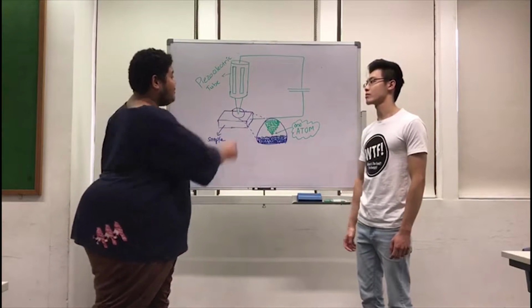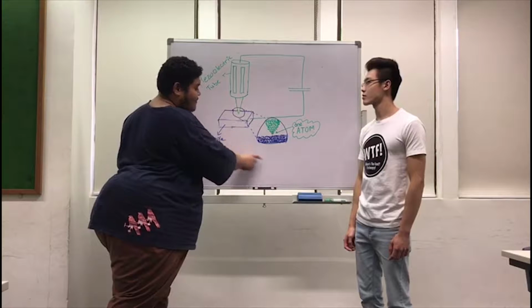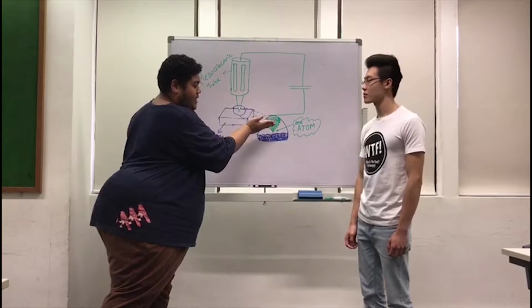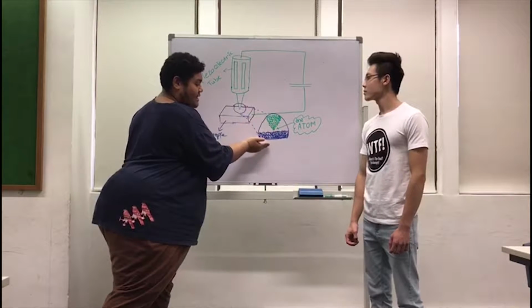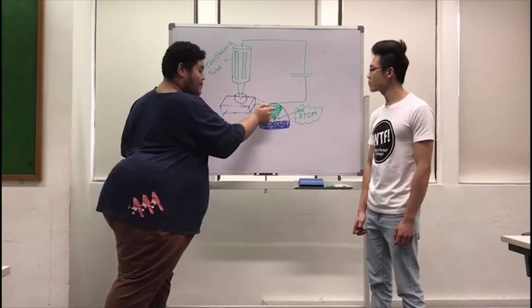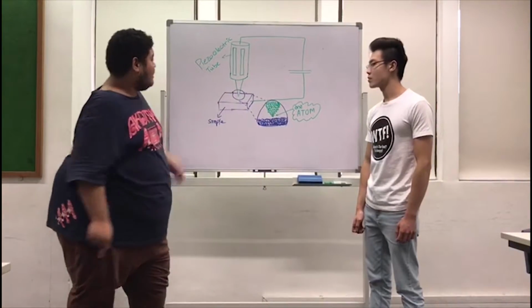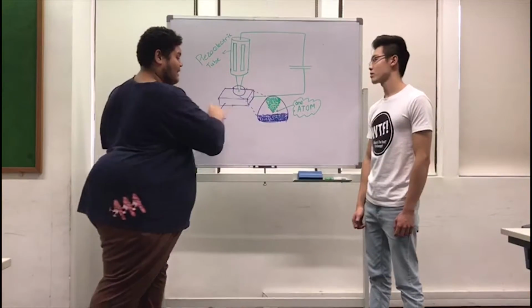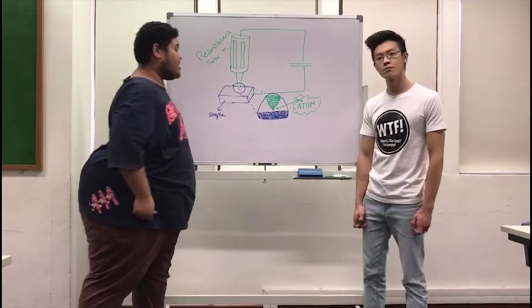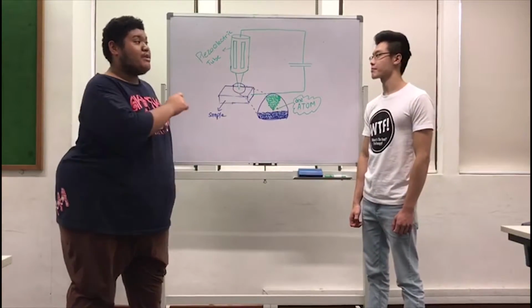When that happens, the probe is brought close enough to the sample such that the barrier between the tip of the probe and the sample is very small. Small enough for the electrons to jump from the probe to the sample, following which the current from the sample is fed back into the system and measured on a graph. And from there, we have an image.